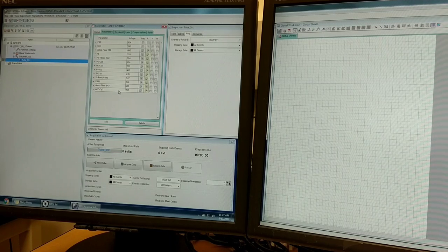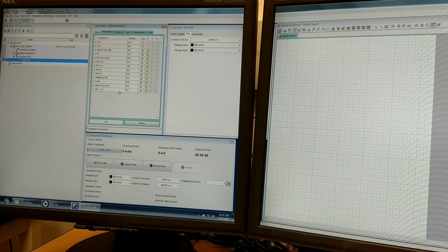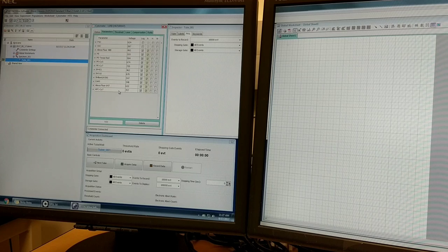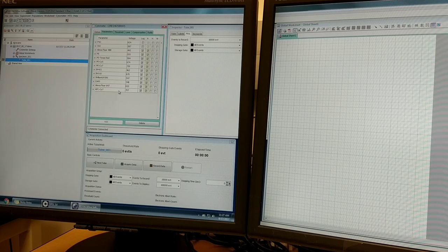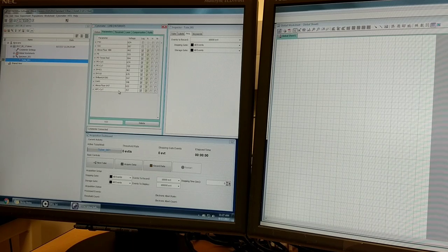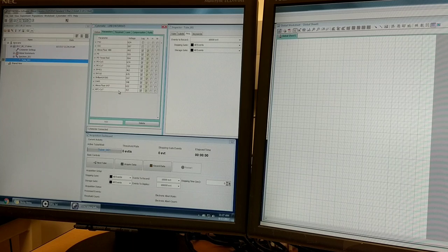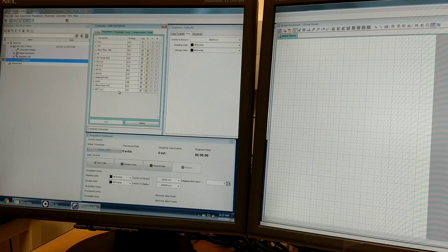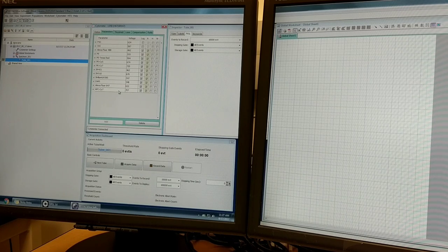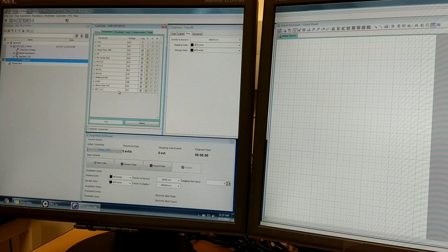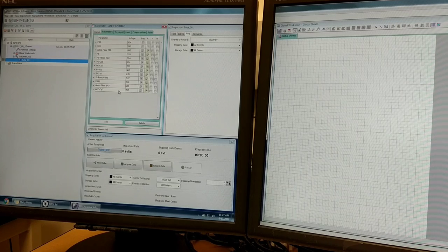I'm not going to discuss compensation in this video because that's a separate topic. The two colors APC and PE that I'm using here won't require any compensation because they don't have any spectral overlap.